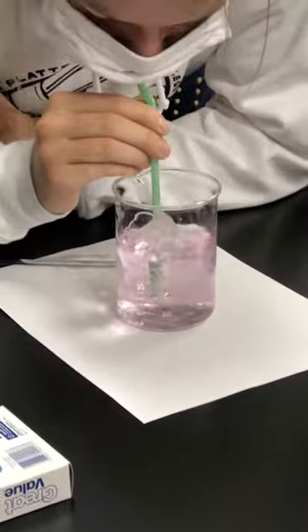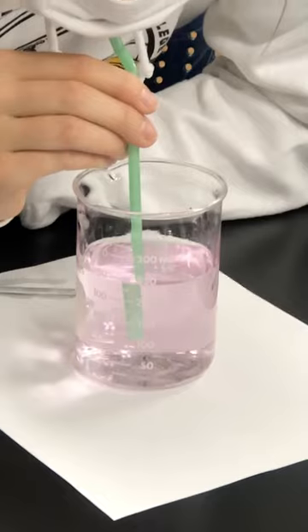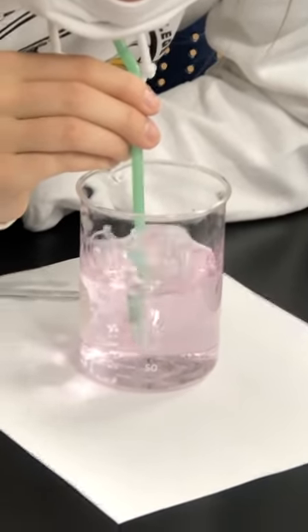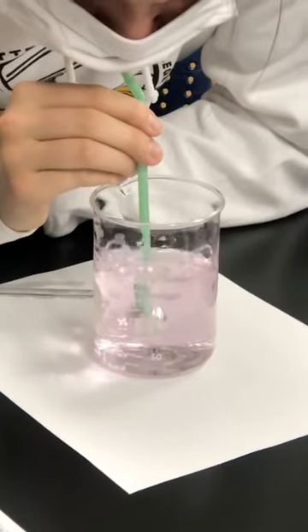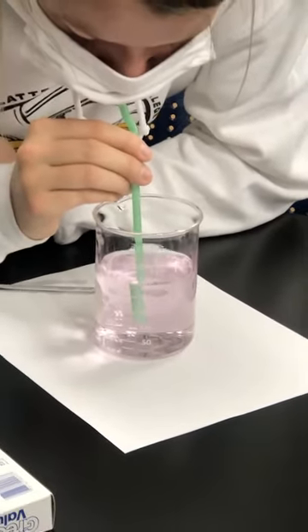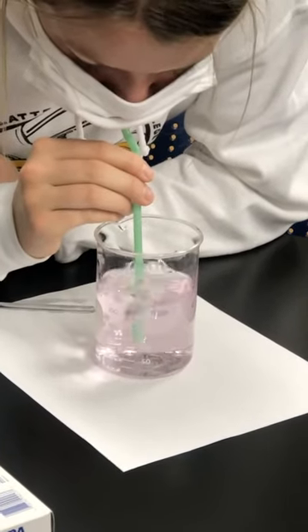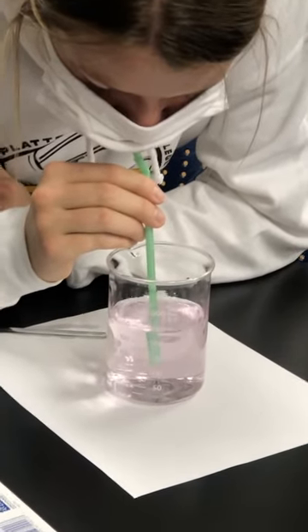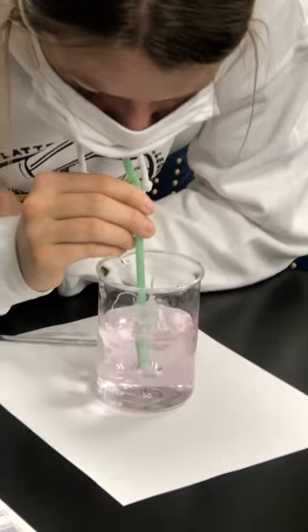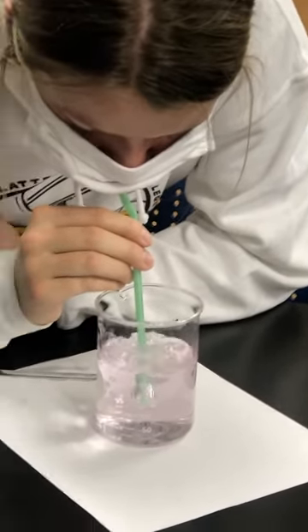And you can actually see as Allison is continuing to expire that it's getting lighter and lighter and lighter in color. And I'm going to have her keep going. Remember, it started out really bright pink, and as you can see, it's gotten lighter and lighter the more she expires or exhales and releases that carbon dioxide. Again, if she continues this process, she's going to get to a point where it's completely colorless because that carbonic acid is neutralizing that basic solution.